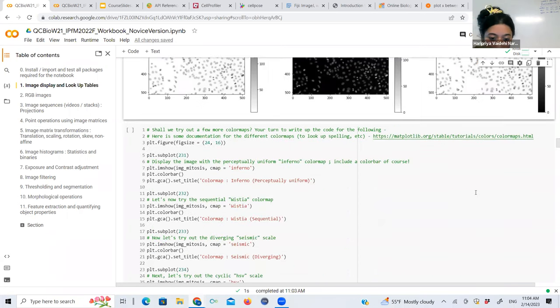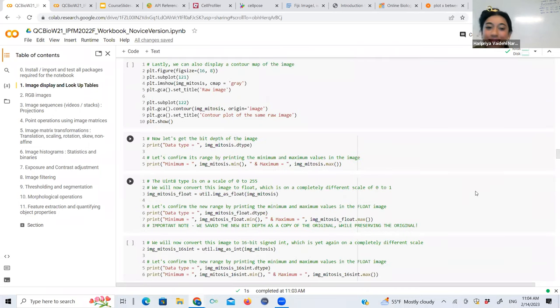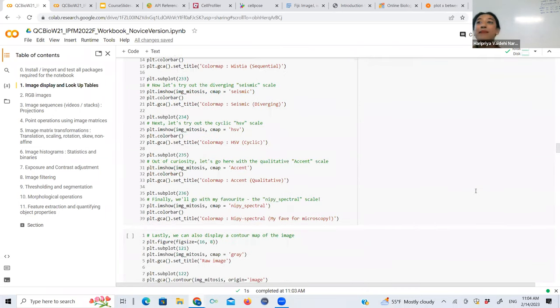Say, subtract from max pixel value, max? Yes, not max, max of the range. So if it's an 8-bit image, it's going to subtract from 255, regardless of whether your max in the image is just 30 or 50. Max of the bit range. Max of the range, yes. The bit range. If your image is a float from 0 to 1, it's going to subtract from 1. It doesn't matter what the max brightness of the image is. It's always going to subtract from max of the range.